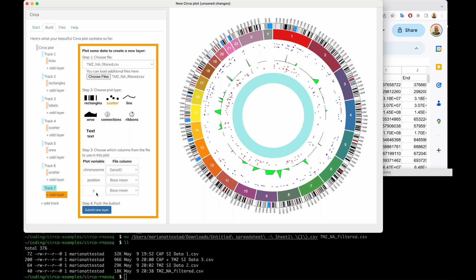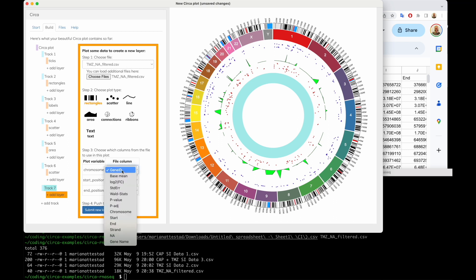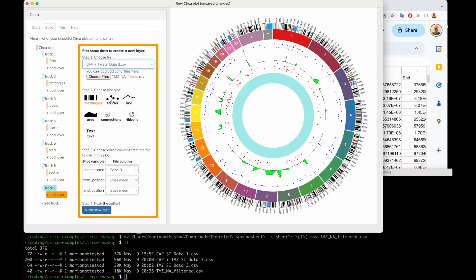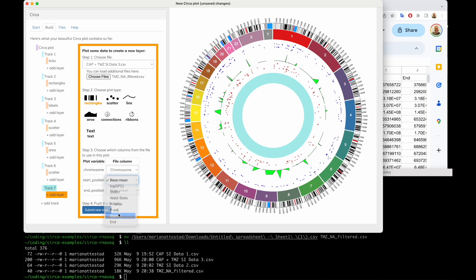For any of these, if you want a Y value, the right layer types are scatter, line, and area — they all have chromosome, position, and Y because they're basically like points, but you can connect them or draw the area under the line. Rectangles might make sense if you just want to draw where all the genes are. Let's try that right now. Sometimes you just have to click the plot type again to make sure the fields reset — start position here, end position here — and boom.